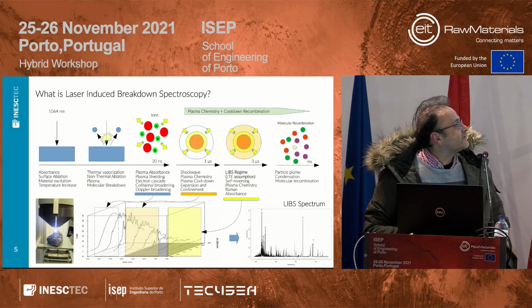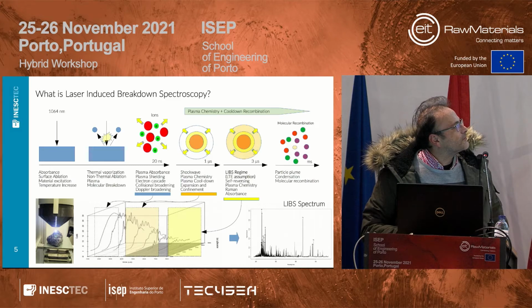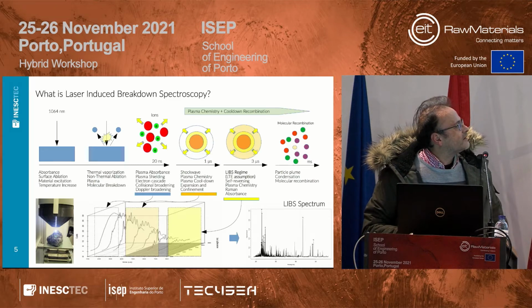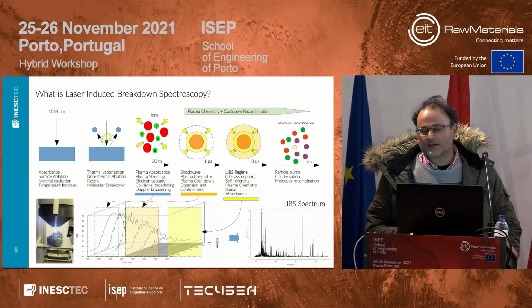The signal continues as this quite continuous line even until 1 microsecond of delay. Only after that do you hear the shock wave, and at this phase plasma chemistry begins to occur in the cooler areas of the plasma.